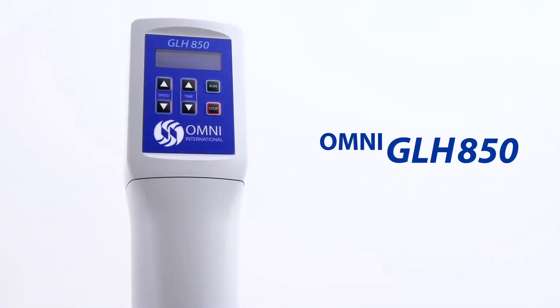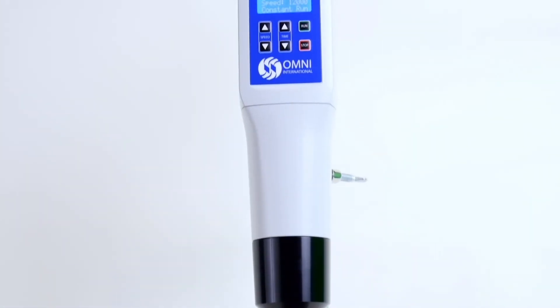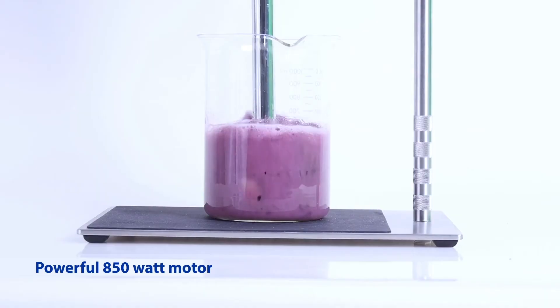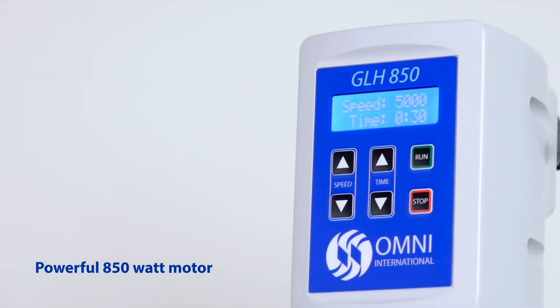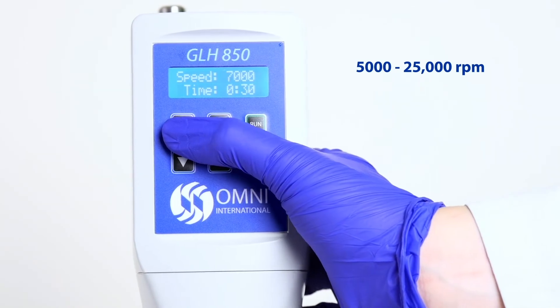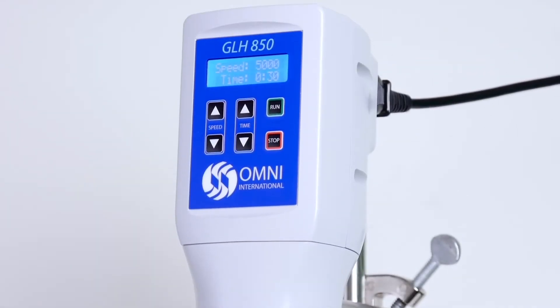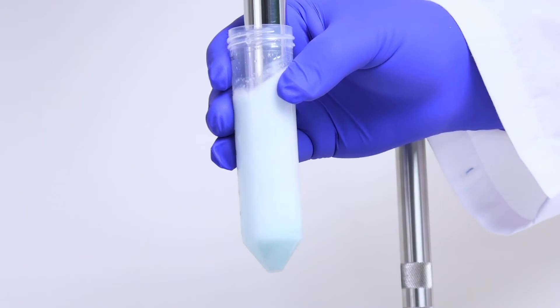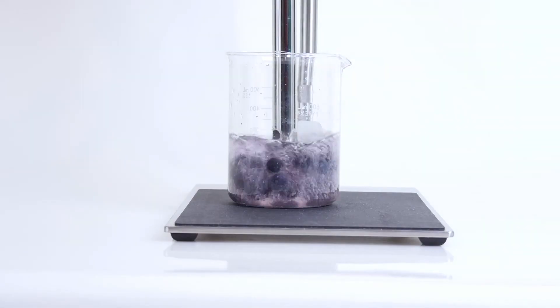The Omni GLH 850 offers the ultimate performance with a powerful 850 watt motor and digital speed controls ranging from 5,000 to 25,000 rpm. It is capable of processing at smaller lab-scale quantities, or at larger production scale quantities, up to 10 liters in volume.